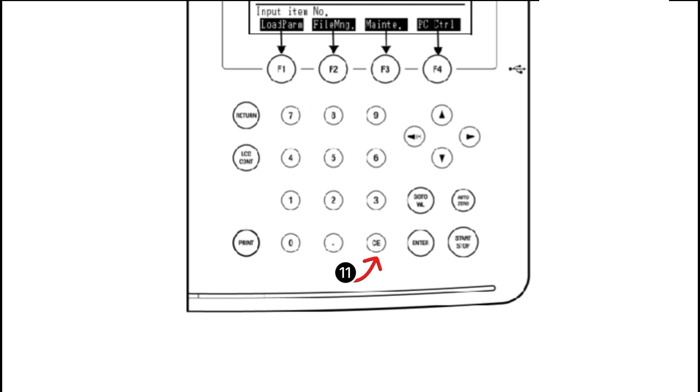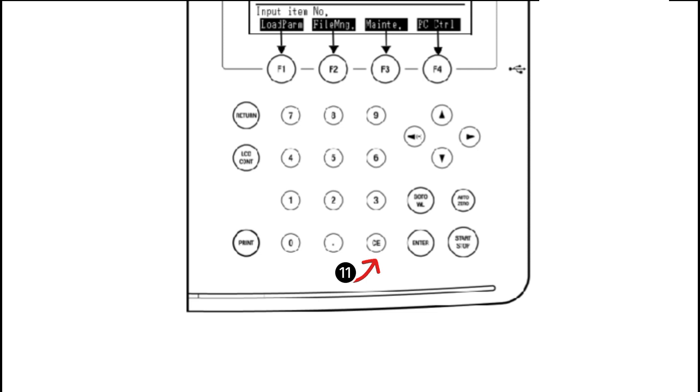Number eleven, CE. This is basically the clear key for clearing numeric values. For example, if we are clearing the value of 10, then we will press the CE key. When you press this key, the numeric value that has been entered will be cleared. This is the overall description of the UV1800 keypad which is given in this video.